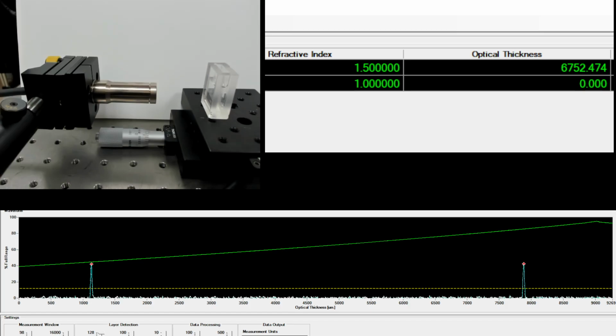We also put in a red beam so that we can see where we're pointing the OptiGauge, and in fact I'll show you the beam now. There's the beam, and you can see when I block the beam that the signal goes away in the waveform there. The beam actually passes through the cuvette and the sample, and what we're really reading is back reflections at all the surfaces. The only two surfaces we're interested in are the interior front surface of that 5 millimeter gap, and the back surface of that 5 millimeter gap.